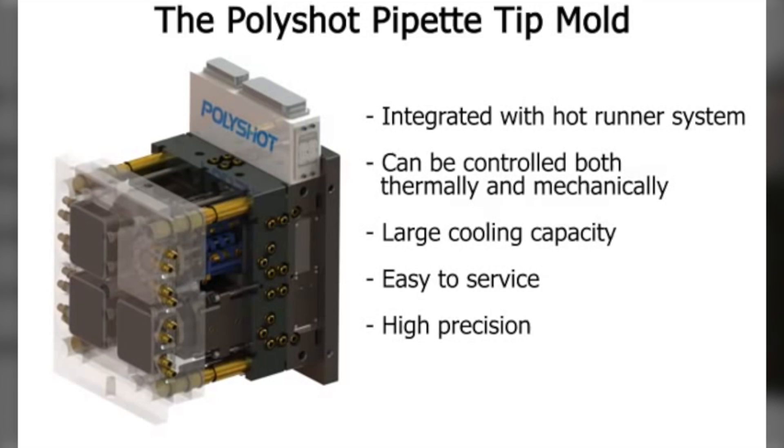The ability to service the mold easily, the unique cavity construction using PMT technology from Blissel Mold, and the huge cooling capacity of the mold make it unique in the industry.